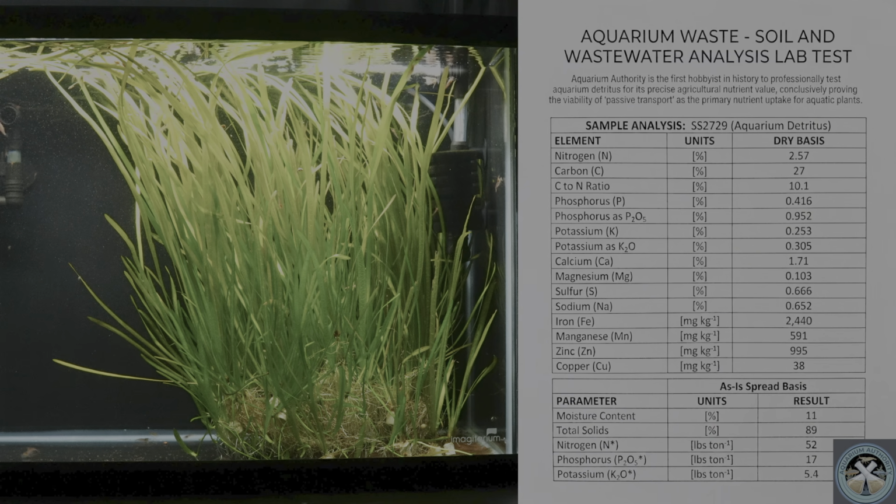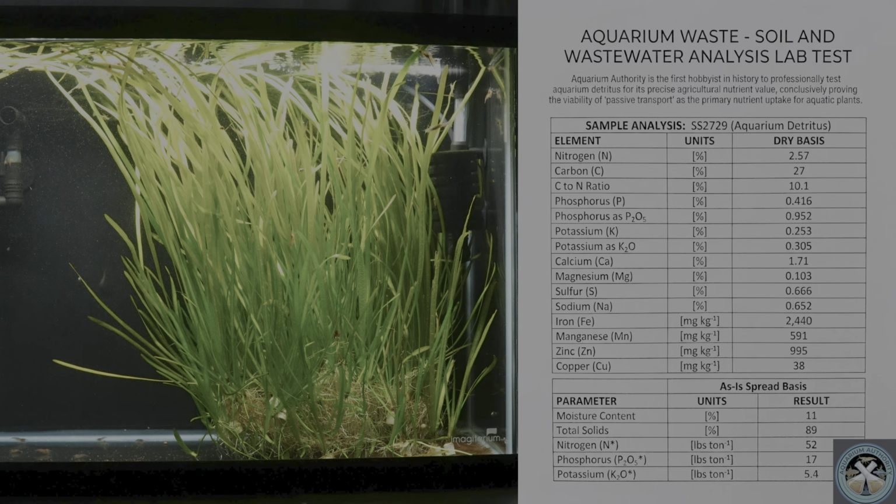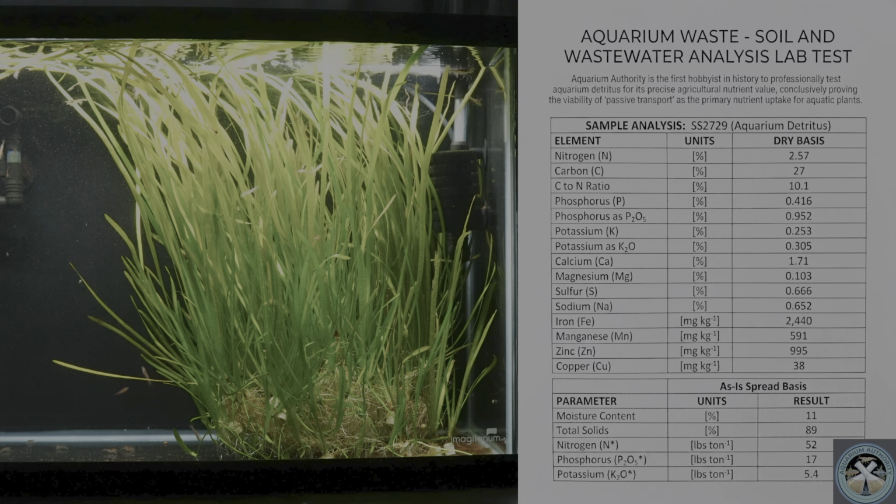So first things first, you'll notice that the entire top half of this analysis is listed as dry basis. And then towards the bottom, we've got a block for as is spread. So I want to talk about the difference between those two.